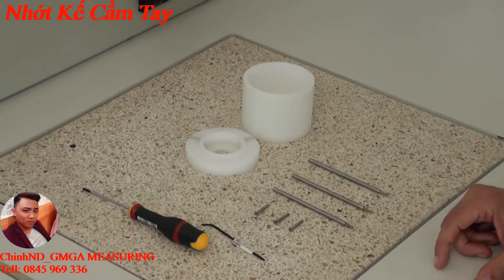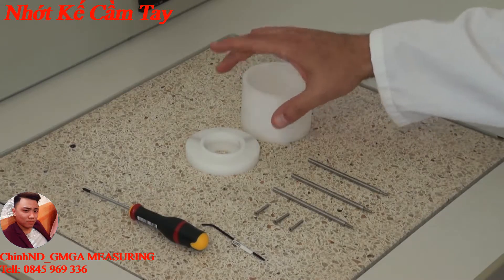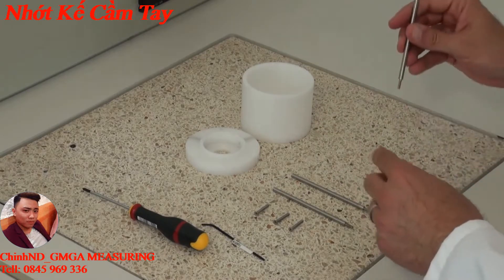Let's come to the construction. The protection cage consists of two pieces: a lid and a base. With the help of threaded rods they are screwed together.